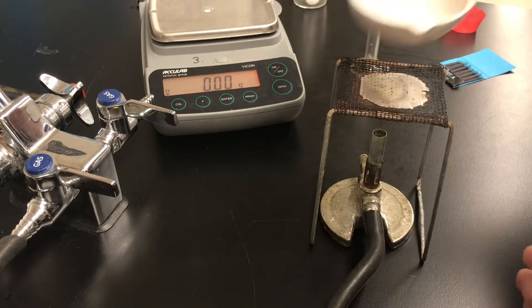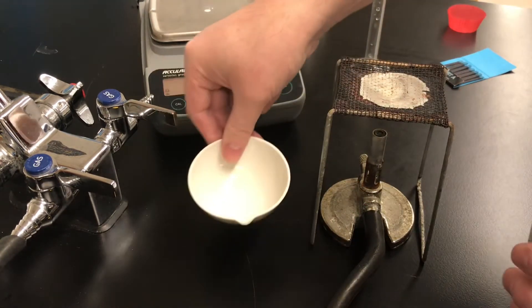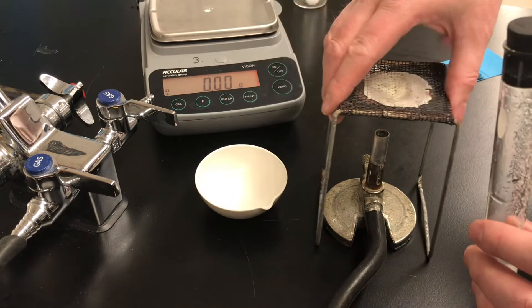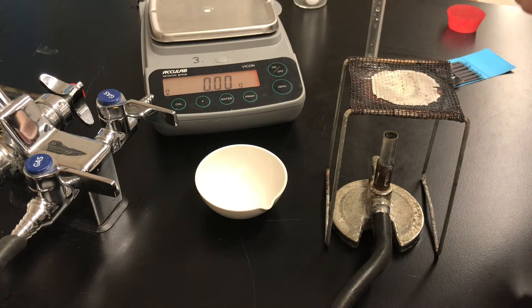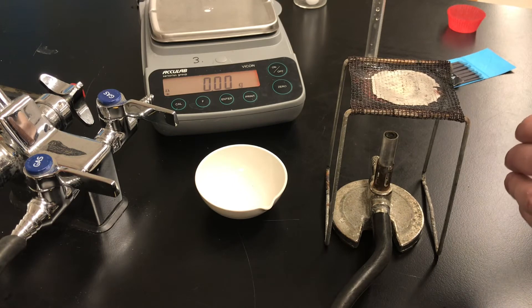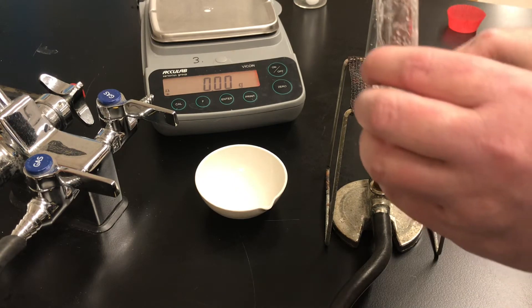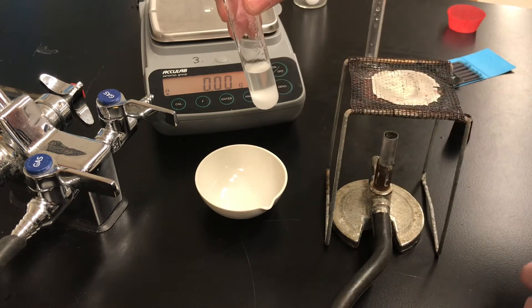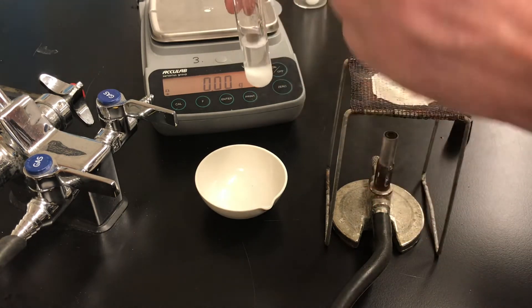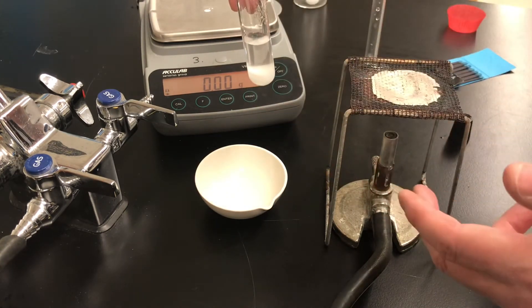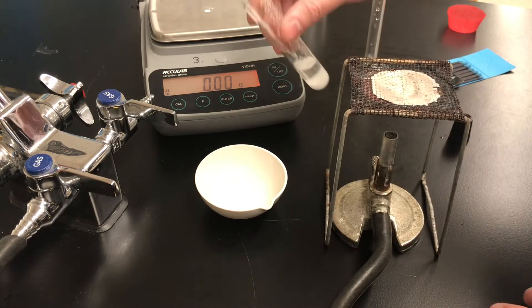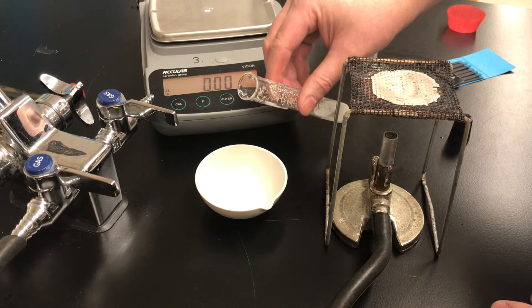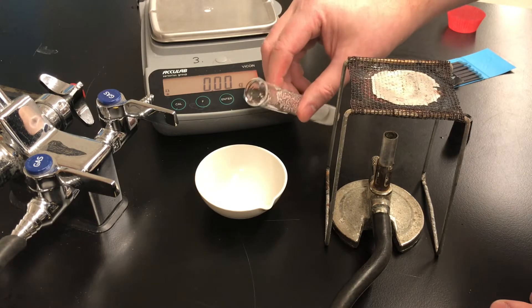Now I'm going to take my evaporating dish that we had already weighed and I'm going to decant. That's an important word you might want to write the definition down. To decant the solution means we're going to pour the saturated solution out of the test tube while leaving all of the undissolved solid behind. When you pour liquid out but you leave the solid behind you are decanting.